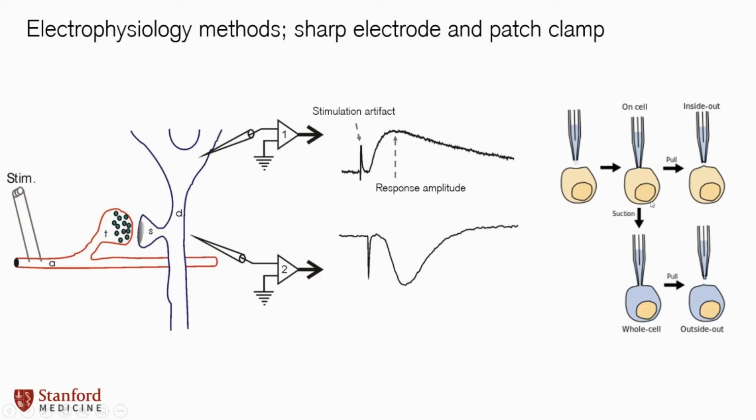And another, even more finely precise measurement of membrane potential, so rather than this bulk difference, you can actually measure the voltage at the surface of the membrane, is to suck onto the membrane with a glass pipette and pull out the piece of membrane. You're almost becoming part of the membrane solution, and then you can measure relative to the outside, and that's called patch clamp. So patch clamp you can do.